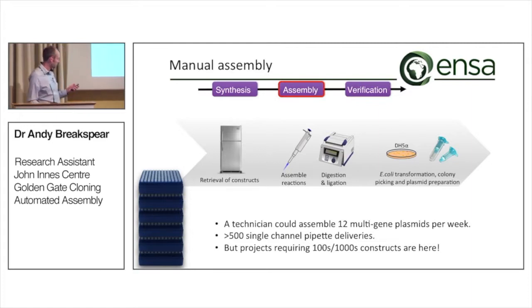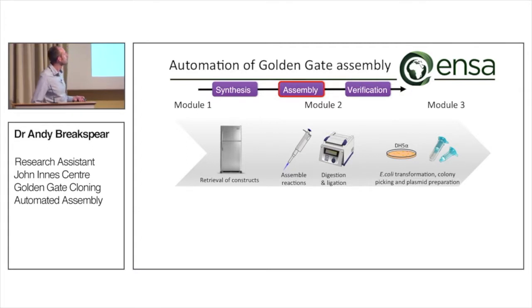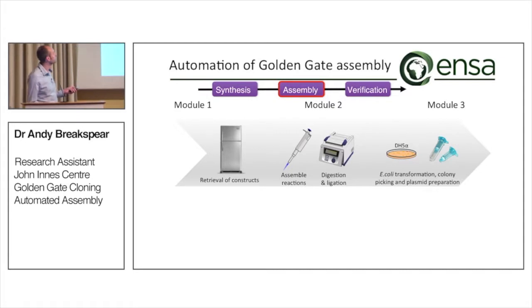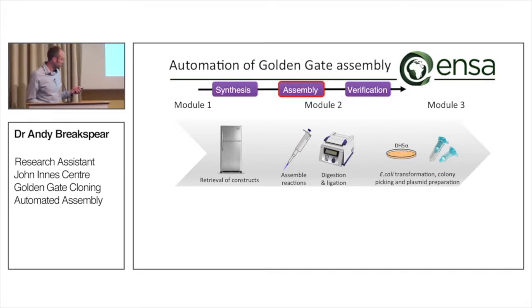But of course, there are projects now, including ours, that require hundreds, and now people are talking about thousands of constructs. So clearly we needed to automate this process. So we sat down with the folks at Earlham Institute and looked at how best to do this. And this was, as I say, about a year ago. And we split it into modules.